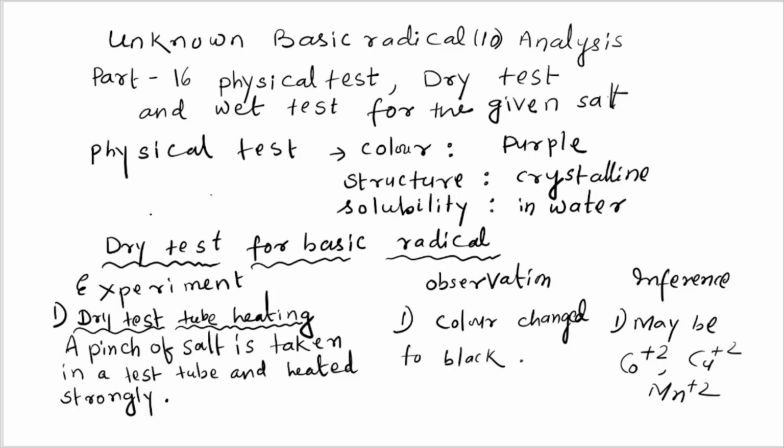This is part 16, where I am going to explain unknown basic radical 10 in salt qualitative analysis. First of all, we will see what tests we will do for the basic radical. First is the physical test, next the dry test, and then the wet test.